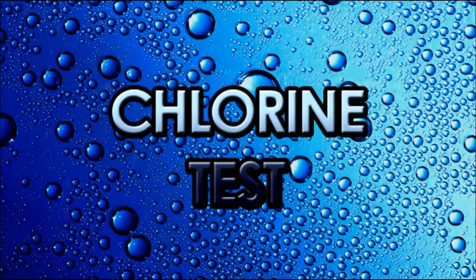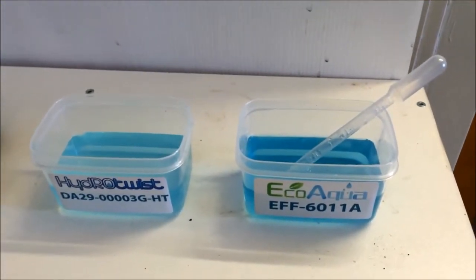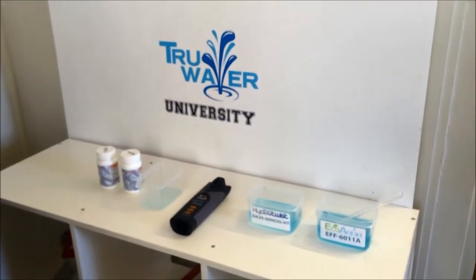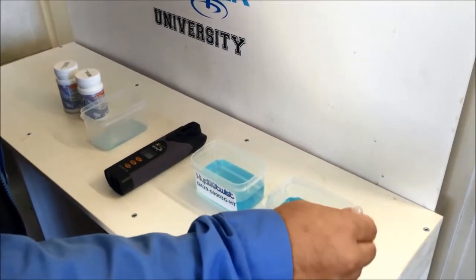Now for our chlorine test. First, the Eco Aqua. We have the water we collected earlier, and now we're going to test it for chlorine traces. These results shown relate to the total chlorine after tap water has been run through this filter.